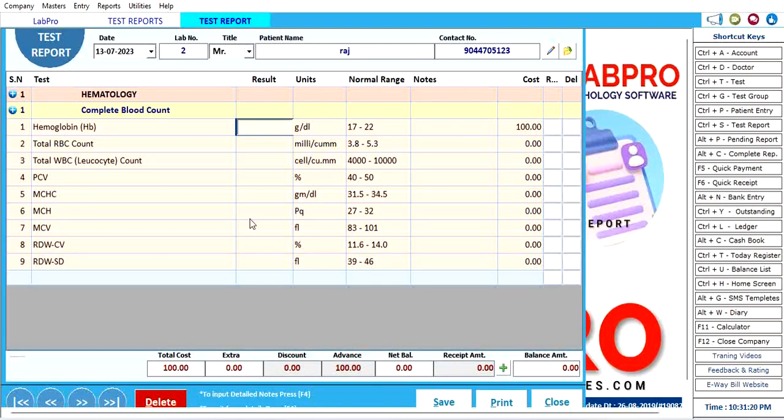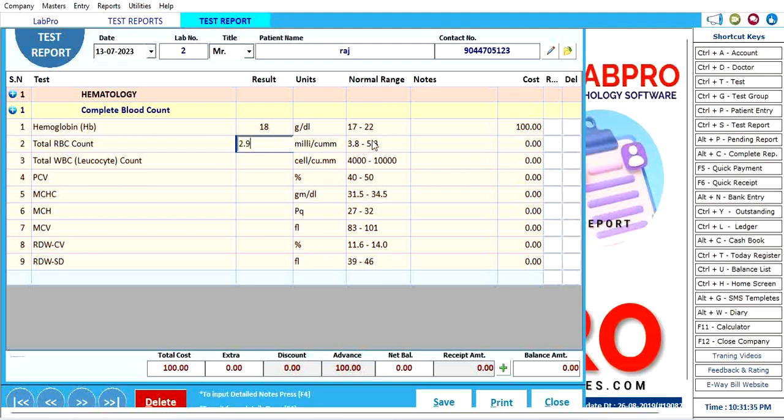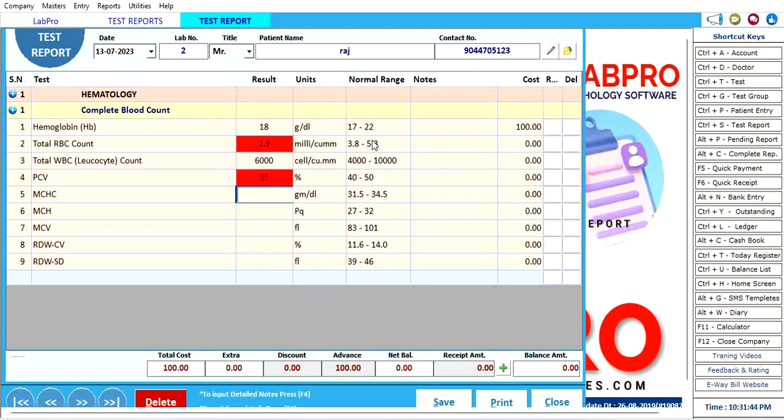The range here, you can check that normal range is already given. If you put the normal values here, that's okay, no color changing. If I put 18, no issue. If I say 2.8, that's very less than the normal, it signals red. Here 6000, that is normal range. If I put 35, that is very less, again red.